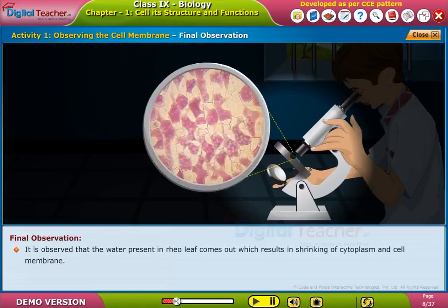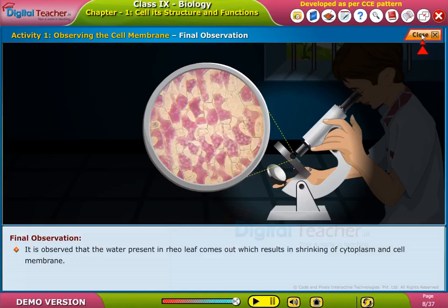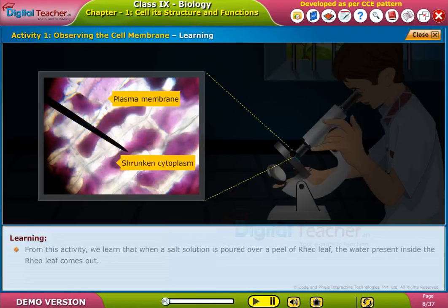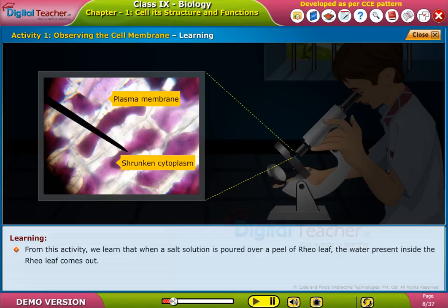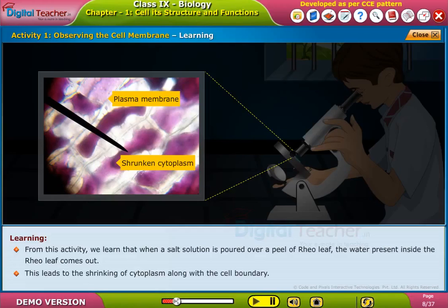It is observed that the water present in the Rheo leaf comes out, which results in shrinking of the cytoplasm and cell membrane. From this activity, we learn that when a salt solution is poured over a peel of a Rheo leaf, the water present inside comes out, leading to the shrinking of the cytoplasm along with the cell boundary.